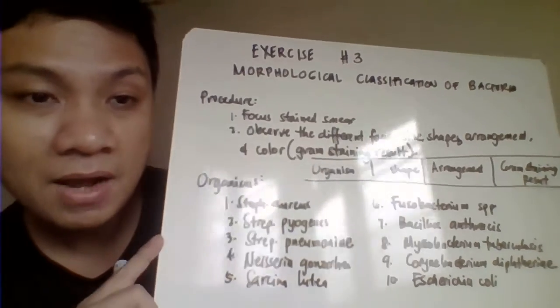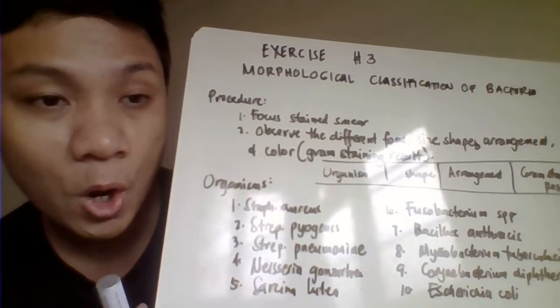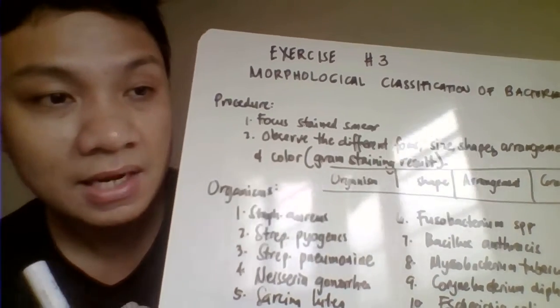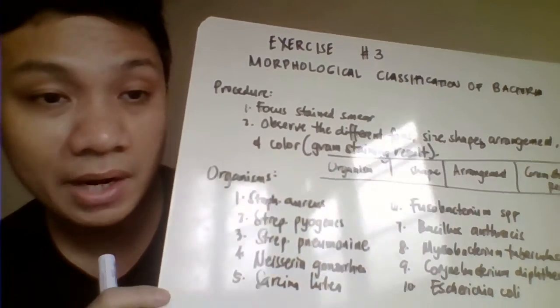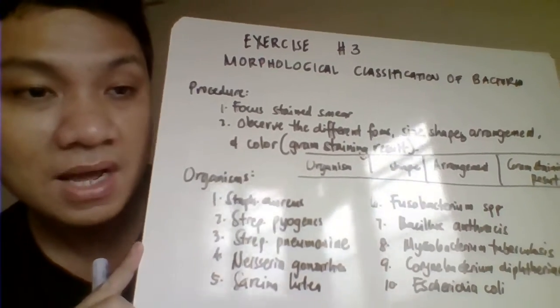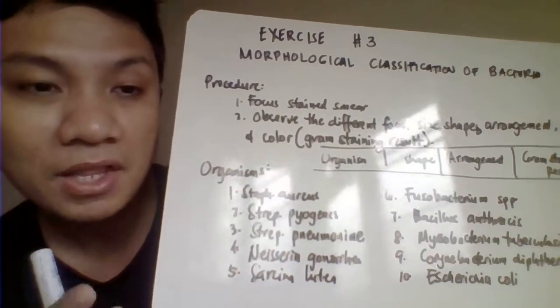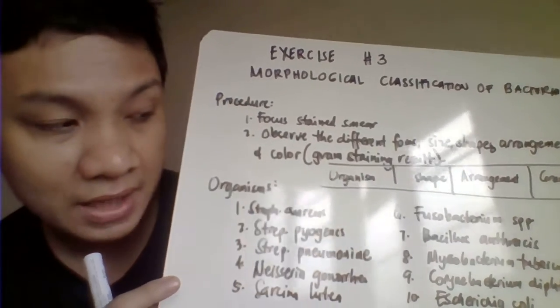Okay, so in your laboratory manual, there are different organisms listed. All you need to do is draw individually in the specified microscopic field, and also put the total magnification, since we are expecting this one as a dried smear. So we tend to identify these different structures under the microscope in the oil immersion objective. That's why you need to label your microscopic field with 1000x total magnification.